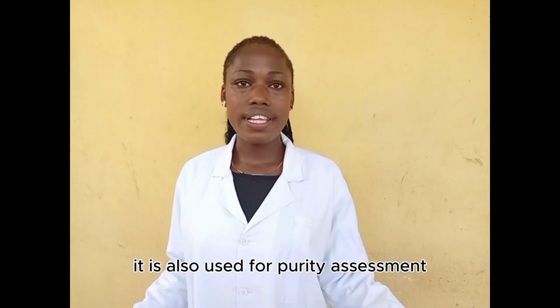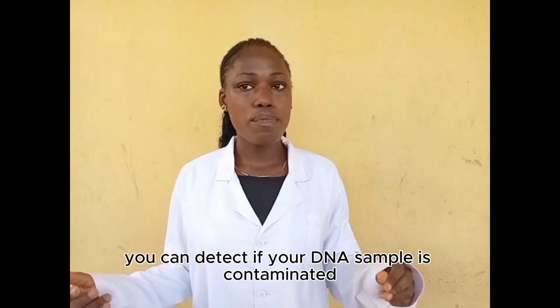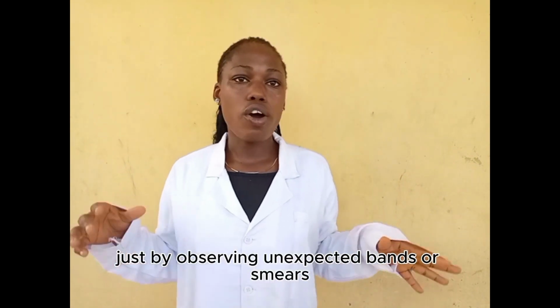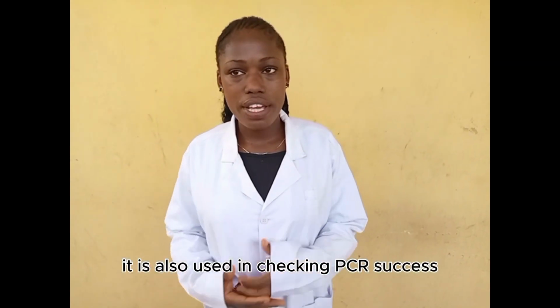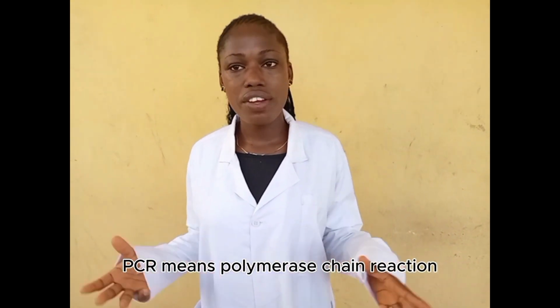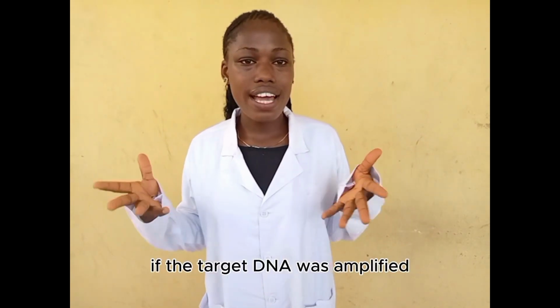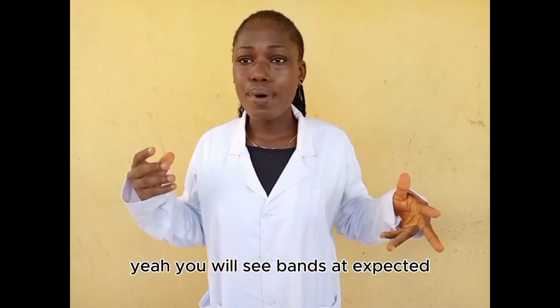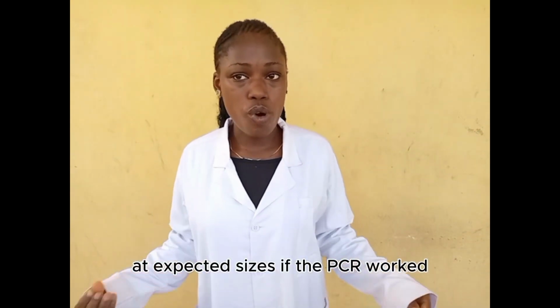It is also used for purity assessment in molecular workflows. You can detect if your DNA sample is contaminated or mixed with other molecules just by observing unexpected bands or smears. It is also used in checking PCR success. PCR means polymerase chain reaction. Agarose gel is used to confirm if the target DNA was amplified. You will see a band at the expected size if the PCR works.